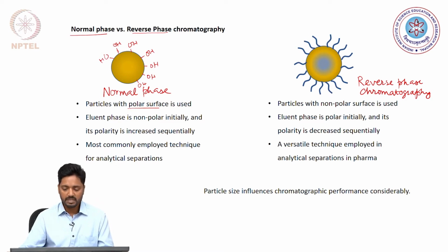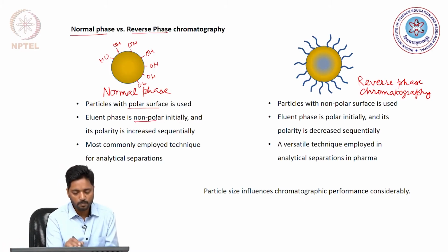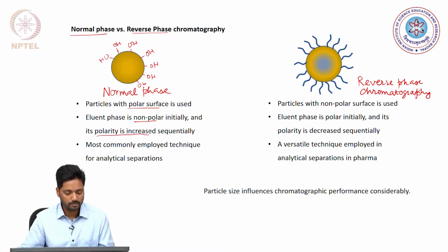So, the partitioning of the analyte between this solid particle and the eluent or the mobile phase is used for achieving separation.